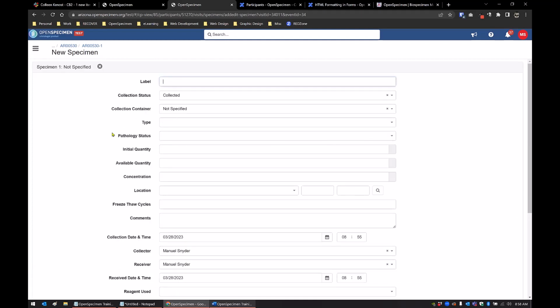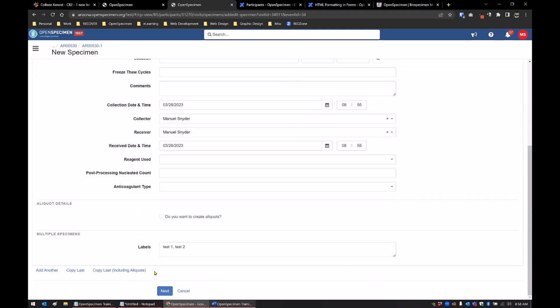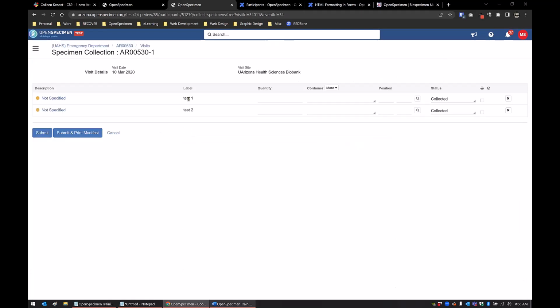Are there any required fields I have to add? I think the rest of the things are not mandatory. Yeah, see this. Okay, sounds good. Because when I was trying it, I was putting in the prefix or something. I thought it was going to auto generate, and it kept telling me that it was not the right format. So I was trying to find where that format was set, and I couldn't find it.